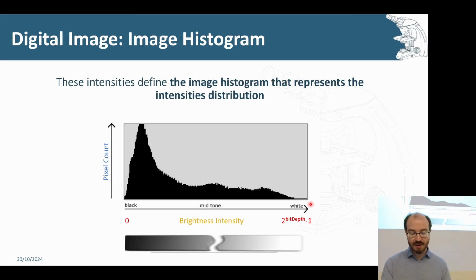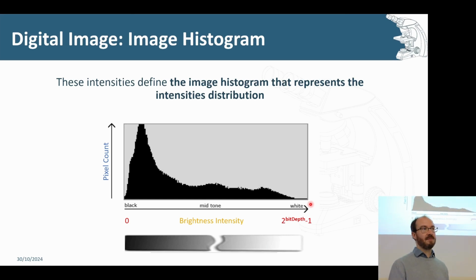Just knowing what's going on with your histogram is a better representation than what your visual perception tells you. Your visual perception might say, hey, everything is kind of the same brightness, and then you look at the histogram and, oh, there is actually some variation. So the histogram is a tool that is used alongside the image.